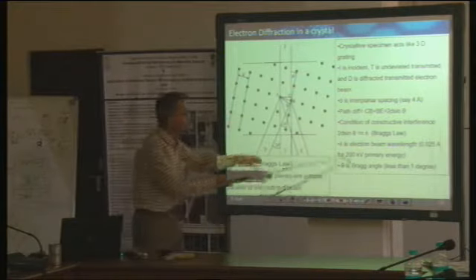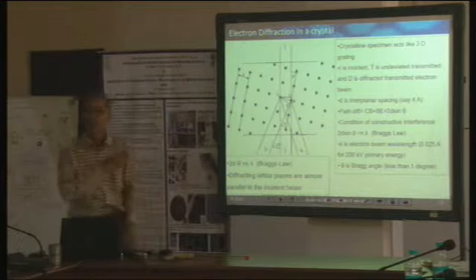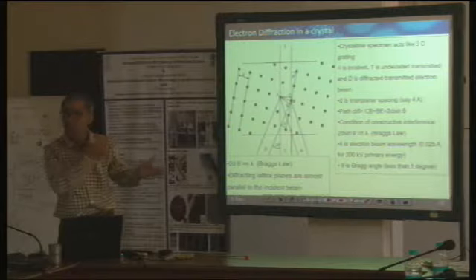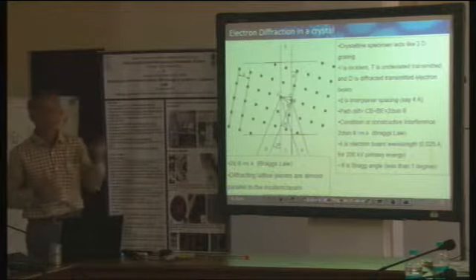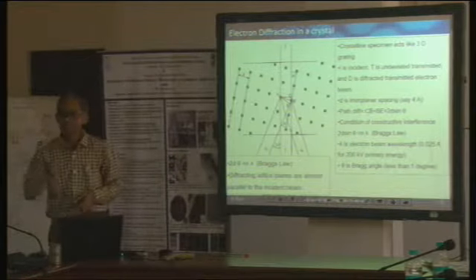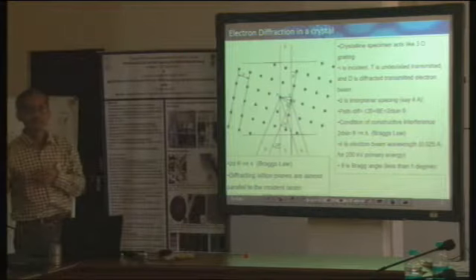Because the angle involved is extremely small, even a slight change from that angle is going to affect the Bragg diffraction condition in a significant manner. And that is why electron microscopy is extremely good to image or to study defects.